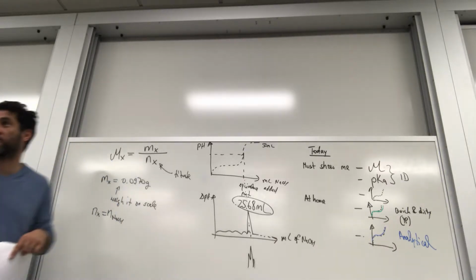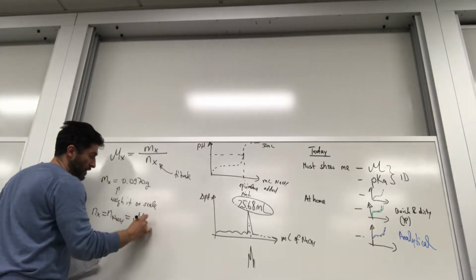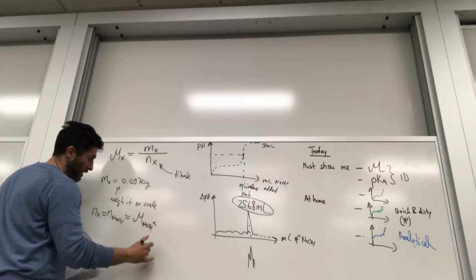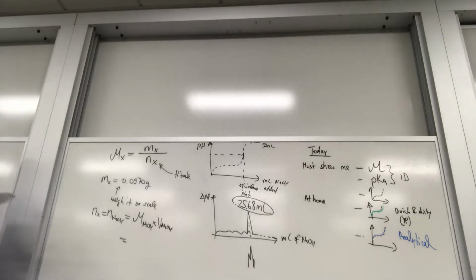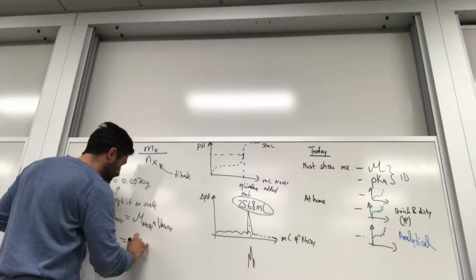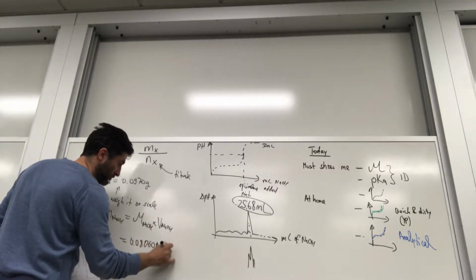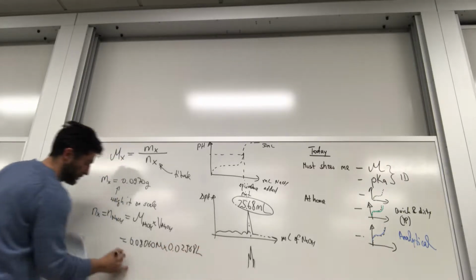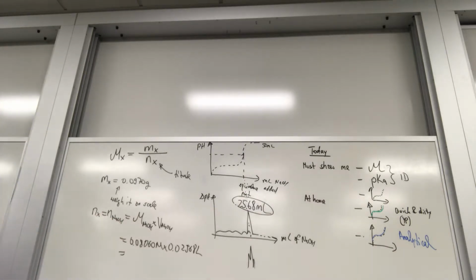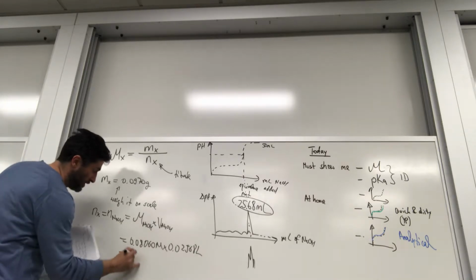It's a monoprotic acid. Okay. And that's pretty much the molarity of NaOH times the volume of NaOH. Now, if I have a titration with your base, you are supposed to have something around 0.08 or something like this in terms of molarity. And if I multiply the molarity that you guys got in the first lab of your base times the volume of titration, you get the moles.